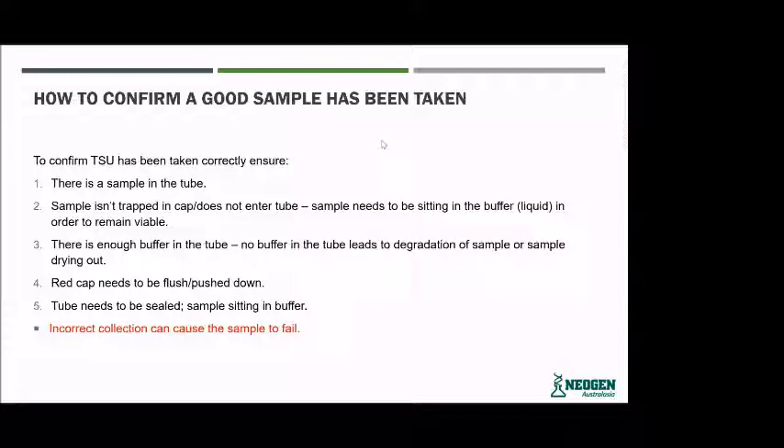Make sure the sample isn't trapped in the cap or doesn't enter the tube. If you don't press the applicator down enough, the tissue can get stuck up within the cap of the tissue tube and doesn't actually sit within that buffer and liquid. That can cause the tissue to dry out and become not a good enough sample to process through our lab. Sometimes, if you don't push the applicator straight down, the tissue can actually come back up out of the tube.